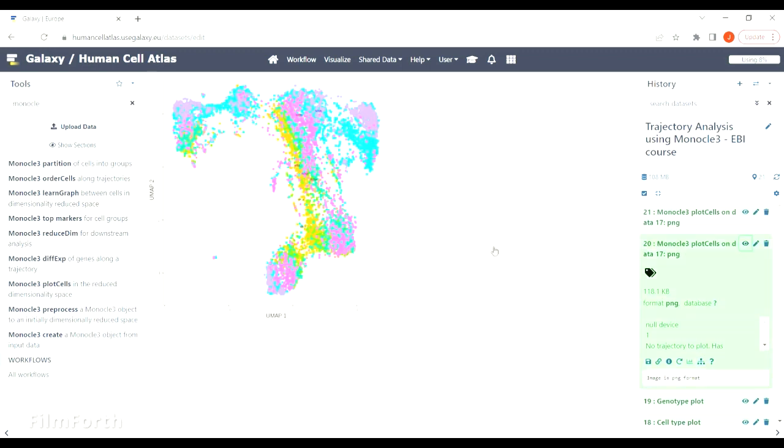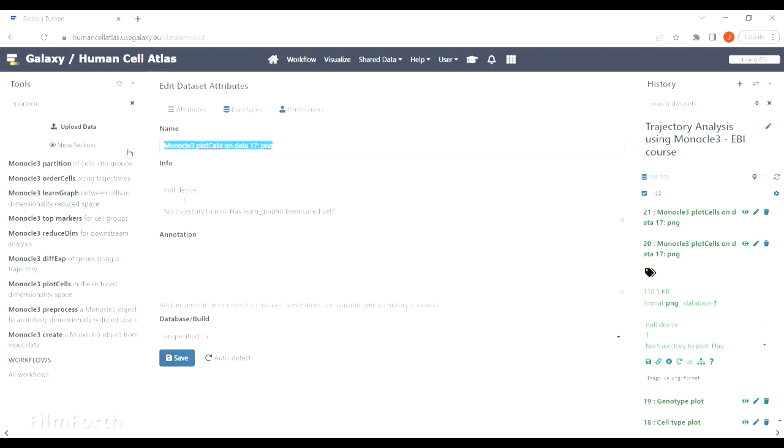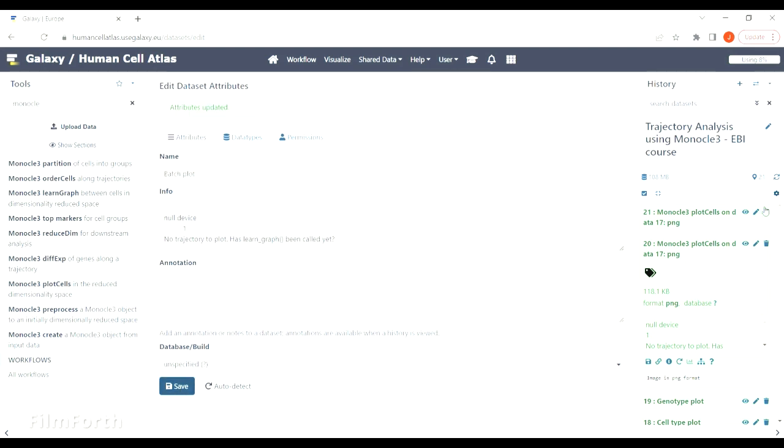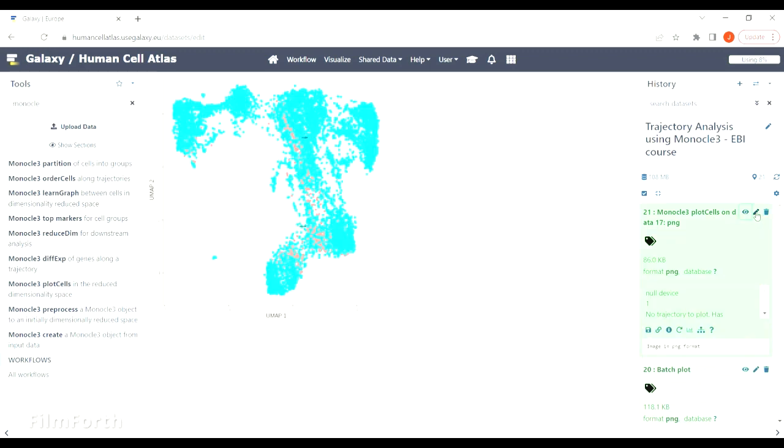The full analysis of the appearance of the plots is in the main body of the tutorial, so have a look at that to get more understanding of the biology behind.